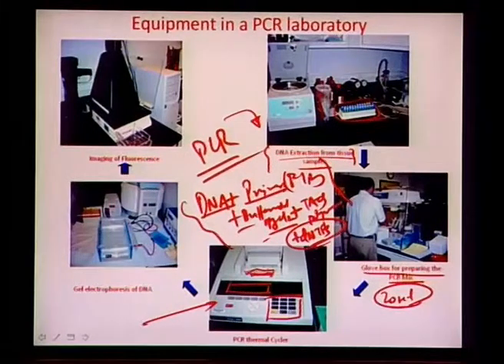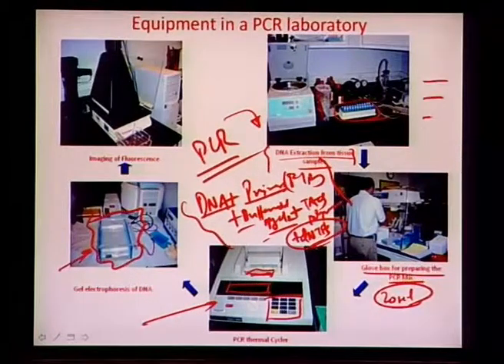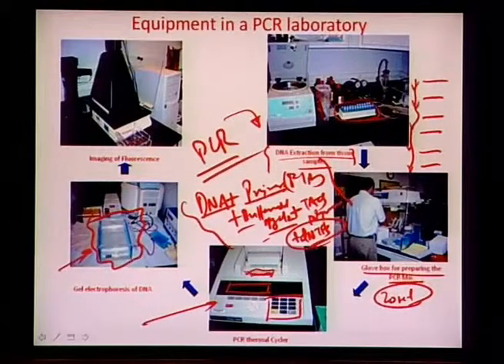Once the thermal cycling is accomplished and the DNA gets amplified, the testing is done through gel material, as this illustration shows. You have a box containing agarose gel with pockets carved in it where the DNA solution can go in. There is also a pocket for a DNA ladder, which through electrophoresis provides different base pair size mobilities and indicates what size of base pair we are amplifying.